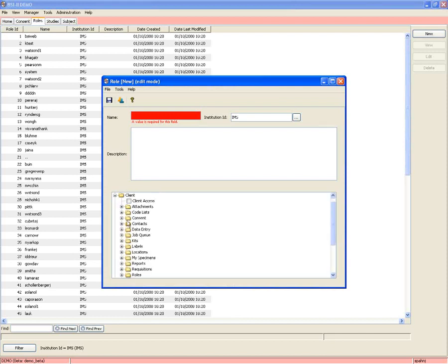If I go down to the consent directory and open it, I can see that there are several new role permissions added for consent, including access to the form manager, access to the patient consent manager, being able to add a consent form, adding questions, being able to add consent values per patient, and deleting patient consent or the forms, and then being able just to view the consent. So those are role permissions needed for consent.